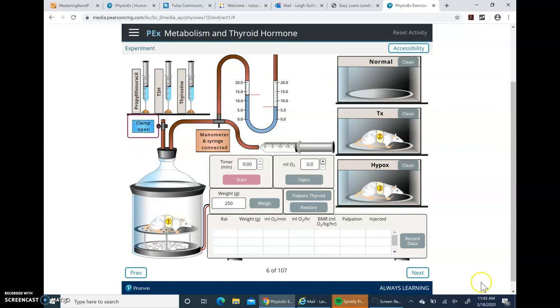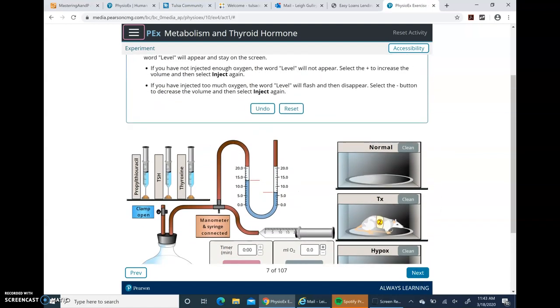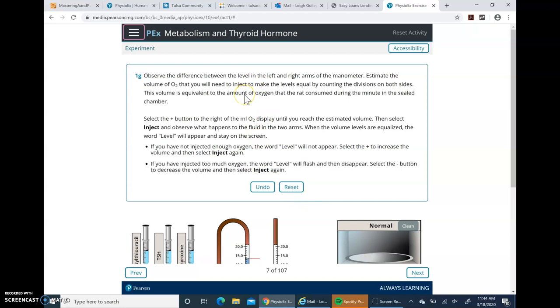We don't want our little rat to suffocate, so it wants us to select the clamp to open so the rat can breathe outside air while we do the rest. We open that up so he can breathe, and click Next. So that's what you do: read the instructions at the top of the page, follow them by clicking on things — it's pretty foolproof because if you click the wrong thing, it will tell you. After you've completed what they asked, click Next. As you go through these activities, you're completing the document provided. Remember, you're only doing the experiment — not the pre or post lab, not the lab report, not the review activity. Click Experiment and complete the document you've been provided.